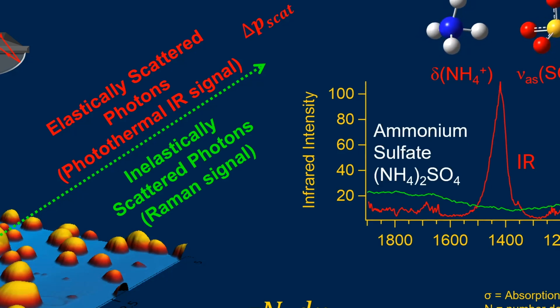And so here you can see the Raman symmetric stretch of the sulfate group at the same time as the asymmetric stretch in the IR, where that has a greater dipole moment, is more active. The polarizability is more active for the symmetric stretch of the sulfate group. And so with these, we were getting them both at the same time. In a lot of the work that we do, and I'm sure in many other fields like materials and life sciences, being able to identify multiple modes, both based on their dipole and polarizability, really opens doors in terms of having greater confidence in our spectral assignments.